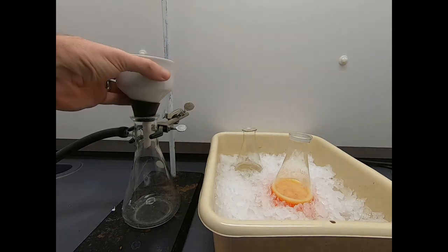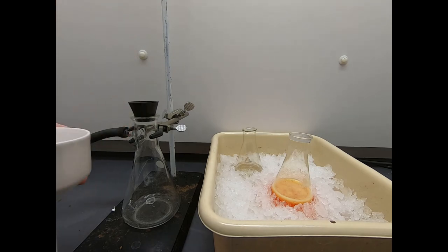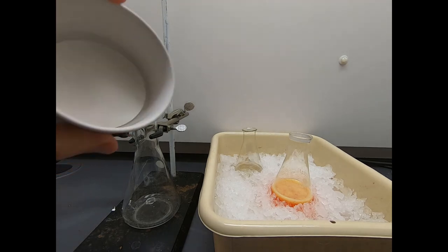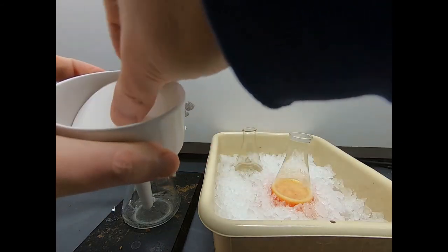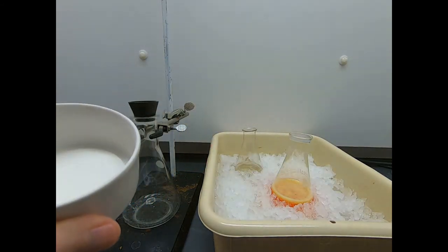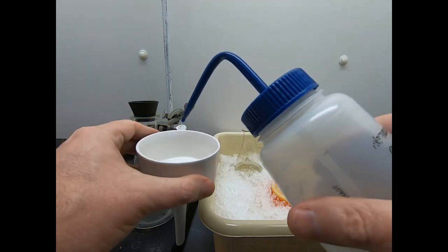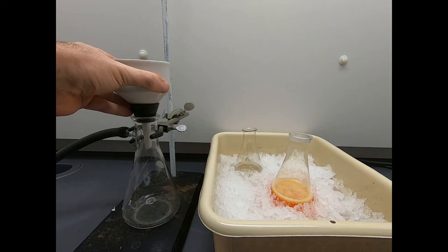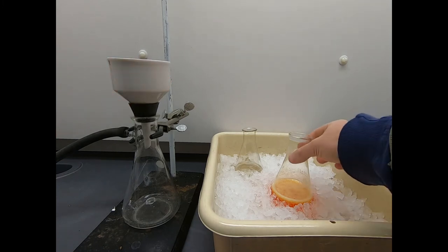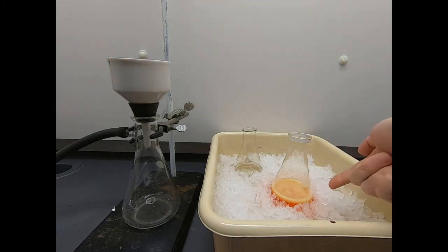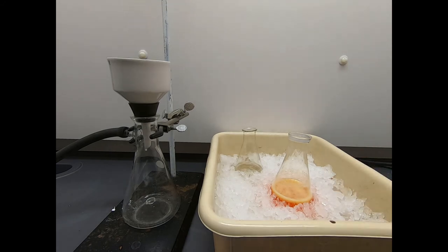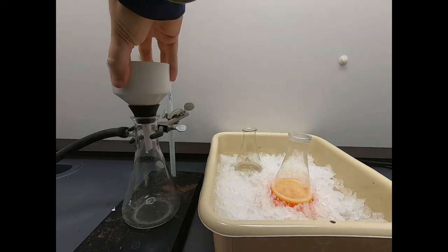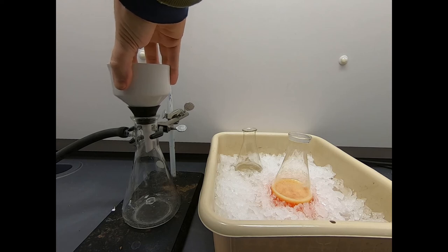Over here we have a sidearm flask. Here is a Buchner funnel with a rubber adapter. We have a hose line that goes to the house vacuum, and we have a filter paper in here. So our first order of business is to seat the filter paper, and we're going to use water for that. We use water because typically you seat your filter paper with whatever your solvent is in your recrystallization. If this were 50% ethanol, 50% water, we'd use 50% ethanol, 50% water to seat the filter paper. Now I'll turn on the vacuum and make sure everything is seated. All the holes in the funnel are covered.